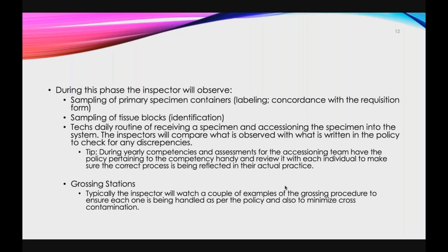They will also observe the tech's daily routine of receiving a specimen and accessioning the specimen into the system. And the inspectors will compare what is observed with what is written in the policy to check for any discrepancies. A tip is during the yearly competencies and assessments for the accessioning team, have the policy pertaining to the competency handy and review it with everyone to make sure that the correct process is being reflected in their actual practice.